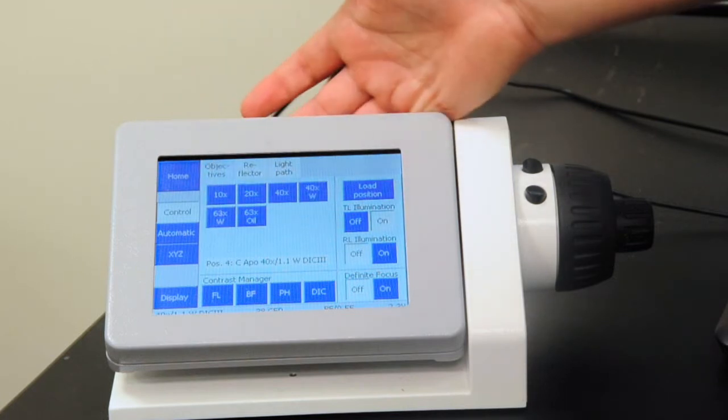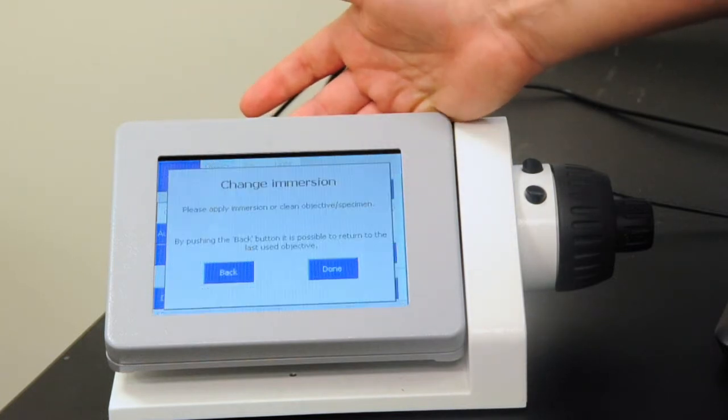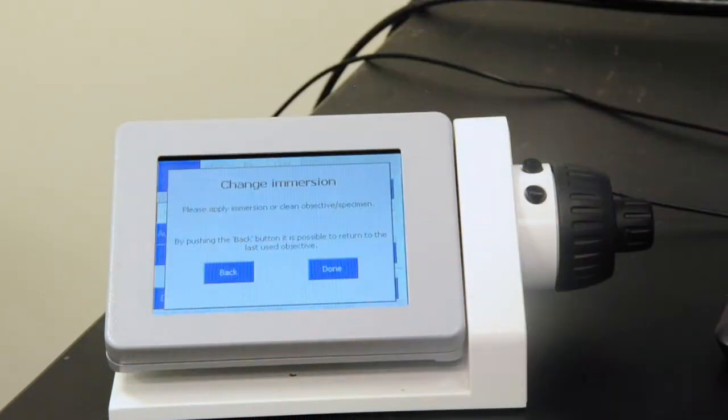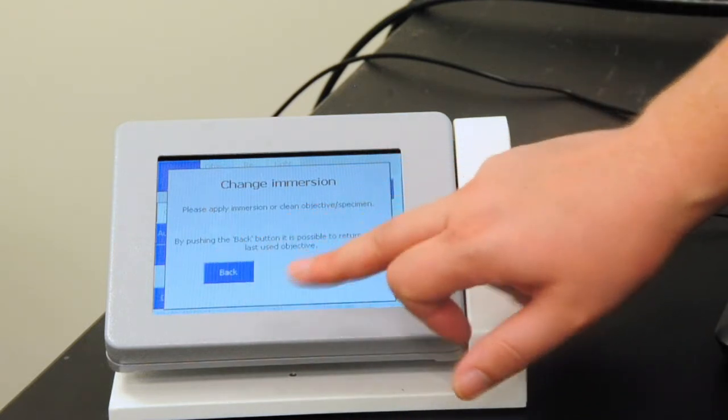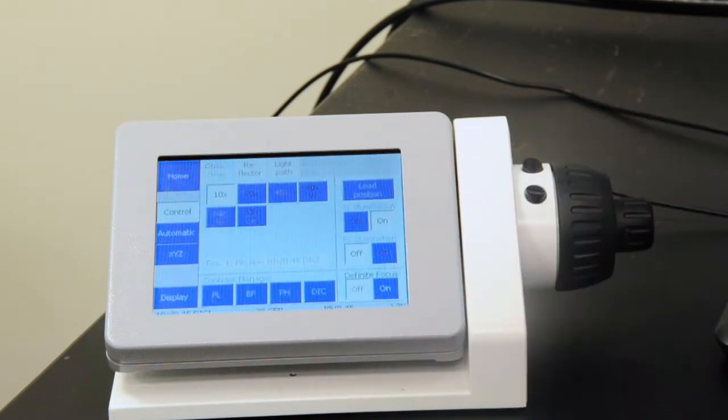First, we have objectives in which we can change the objectives for this. If we're going from a dry objective to immersion objective, we actually have it drop down and ask you, have you done this to ensure that we don't get oil or water on a dry objective. If you don't want to do that, you can press back, or if that's what you actually wanted to do when you cleaned up, press done, and it will rise back up into place.